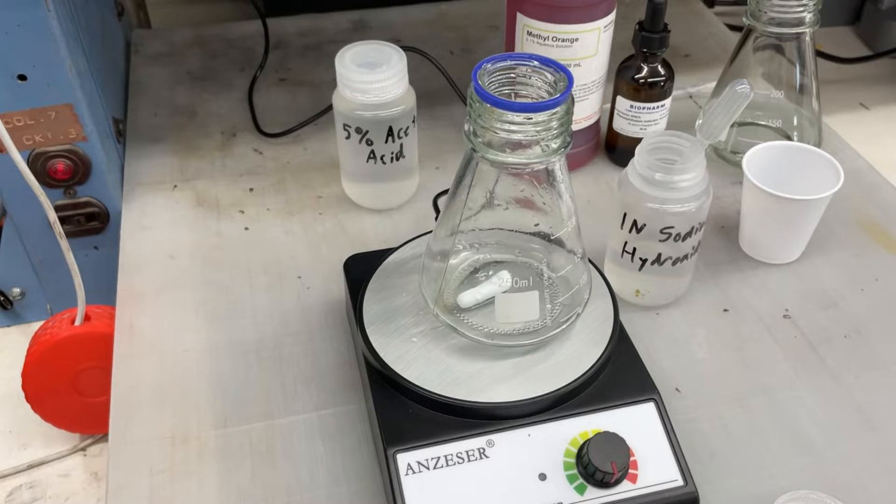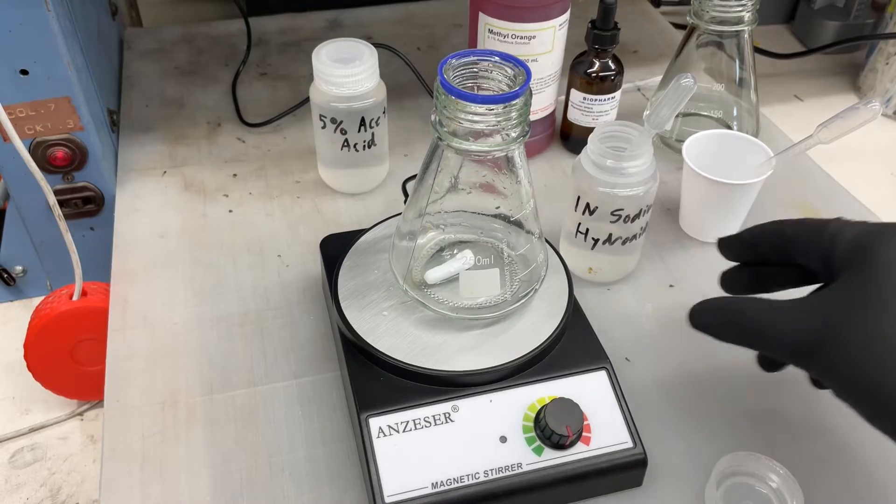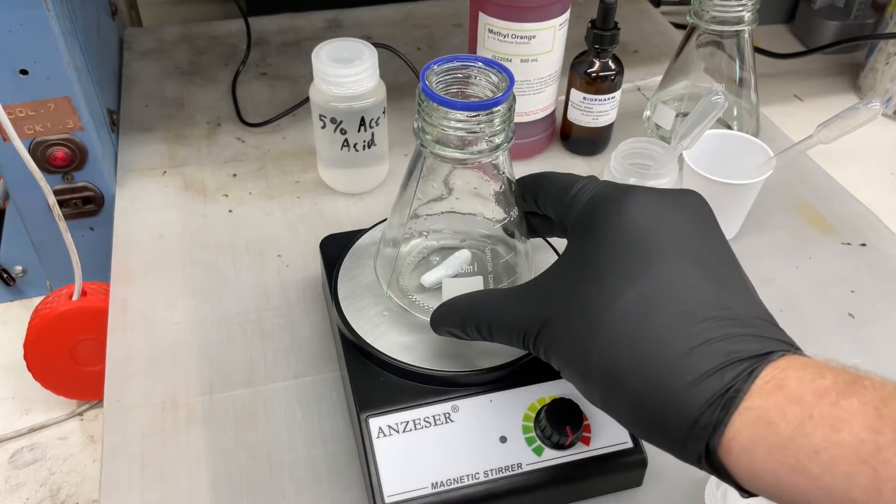Hey guys, Cameron with Iron Forest Knives here. I just wanted to show you guys how I do titration on my anodizing bath to check the dissolved aluminum levels and the sulfuric acid level. I am not a chemist, so do this at your own risk, but I'm following the directions out of Aluminum How-To by RH Probert. I would highly recommend it if you're going to get into anodizing.